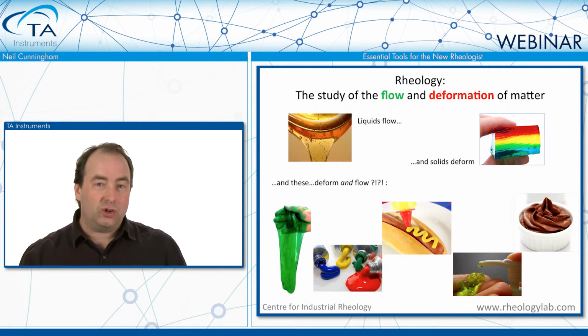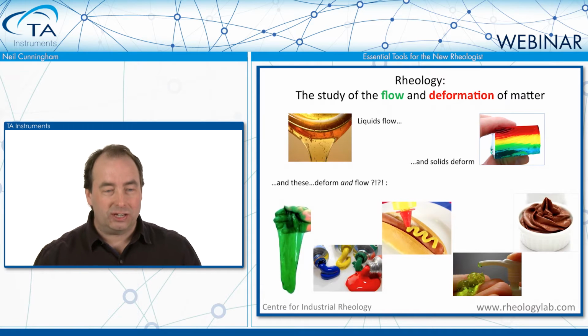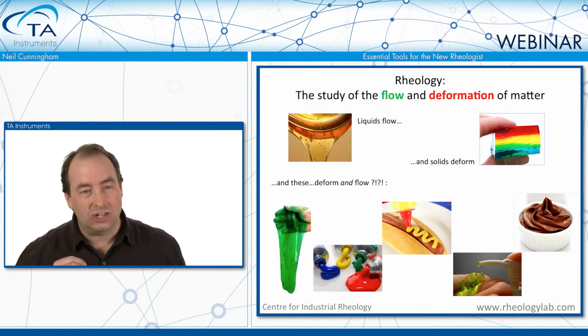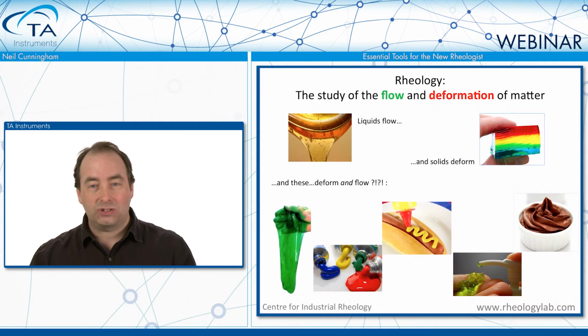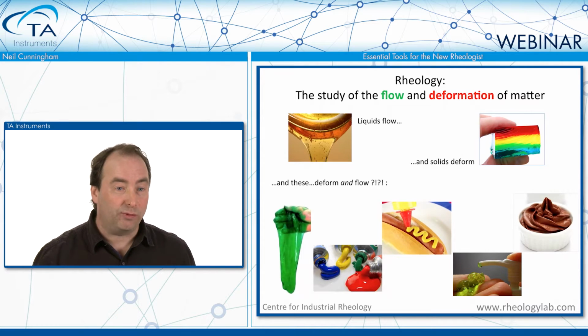Well, what I'd like to do is show you a simple method for categorizing these products that will assist you in making decisions as to what are the best metrics to capture for these materials, and what are subsequently the best rheological test methods to perform on these materials.